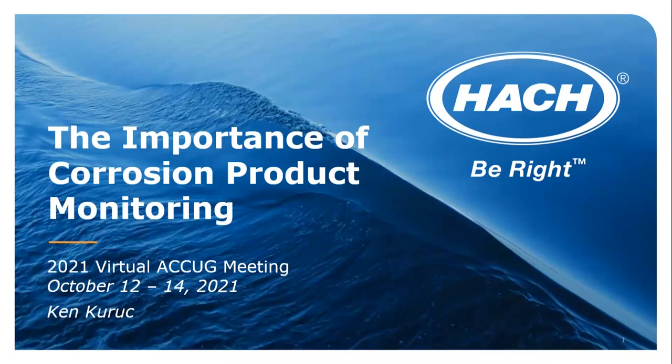Both Jeff and Shana shared an online method called laser nephelometry. They've also mentioned the ferrozine test. What I'm going to do is take a little time to discuss that in a little more detail and give a real practical, quick overview lesson of how you can implement that in your plant or in the facilities that you're responsible for. This is a very easy, relatively low cost and relatively labor-free method of verifying what is going on in your process.